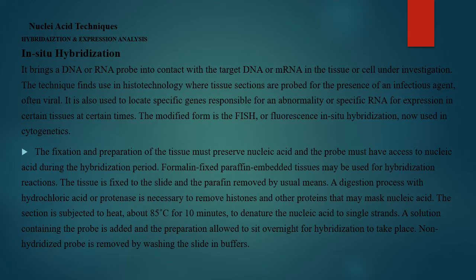The tissue is fixed to the slide and the paraffin removed by usual means. So after fixing and then embedding in paraffin, you remove the paraffin. A digestion process with hydrochloric acid or proteinase is necessary to remove histones and other proteins that may mask nucleic acid. Remember the histones, the DNA winding up around something. Remember that, histones.